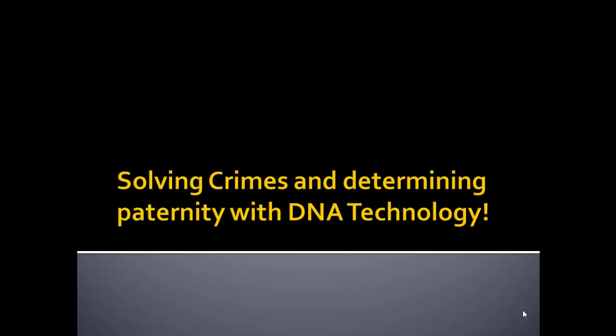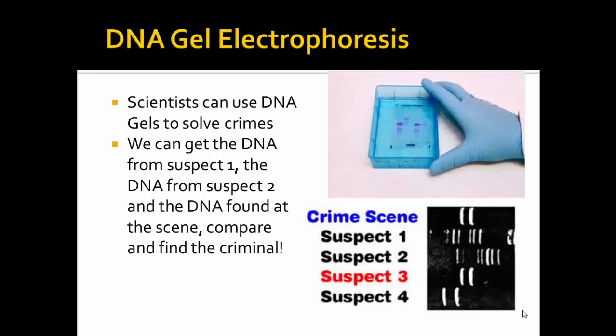Today we're going to be looking at a technique that scientists and forensic scientists use to solve crimes and also to determine paternity with DNA technology. So this technique is called gel electrophoresis, so DNA gel electrophoresis.